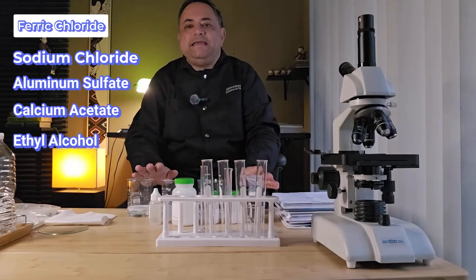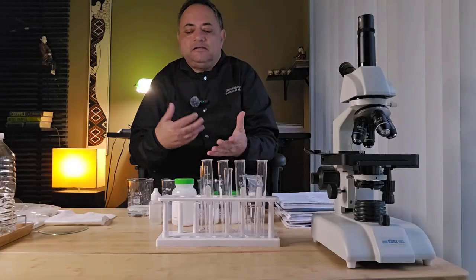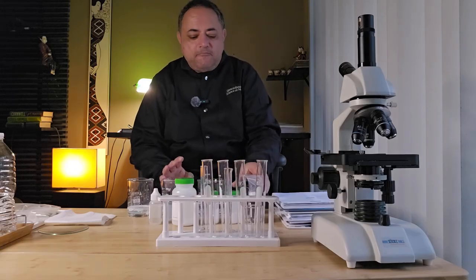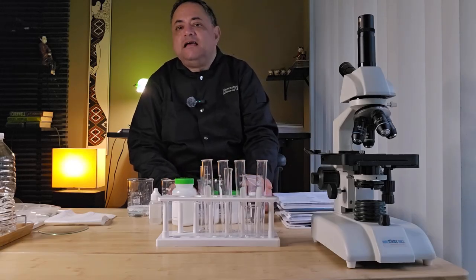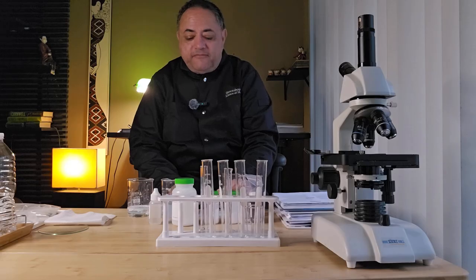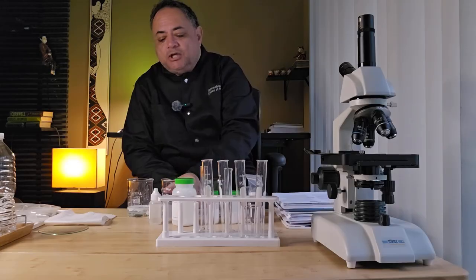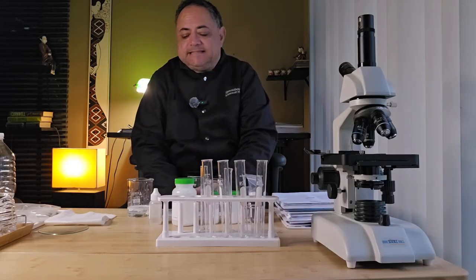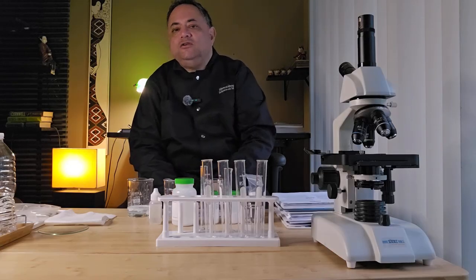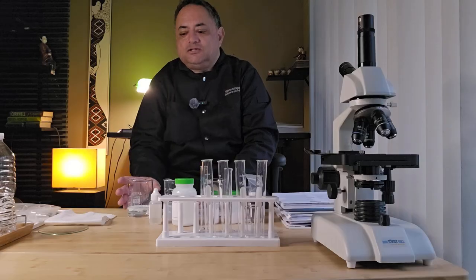Now, I've already made the solutions ahead of time in the interest of time, and you don't really want to watch me making up different solutions. So I've made up a 30% iron chloride solution. You'll need to make a 0.5 mole per liter sodium chloride solution. You will need to make a 0.08 mole per liter aluminum sulfate. And then you need to make a saturated calcium acetate solution.